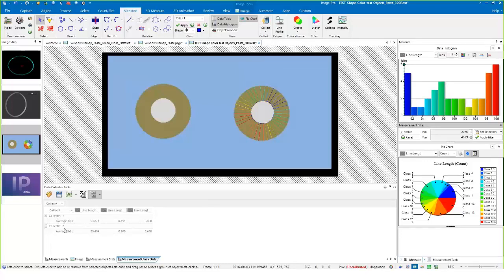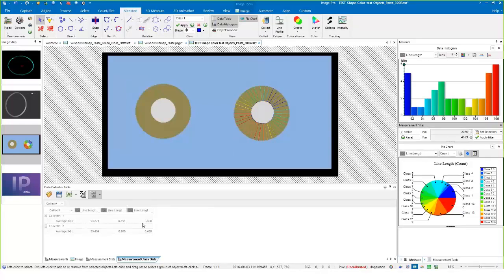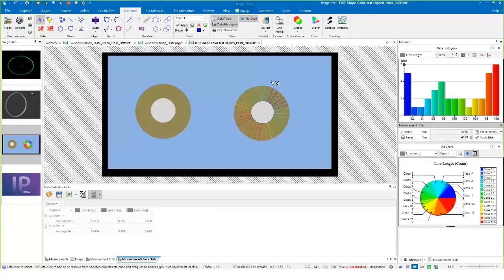Now we can see the two sets of data from our first collection. We have numbers like 94 and the second one is 99, so these segments, the average line length was obviously larger here. Our distribution and our ranges are higher also. So anyway, this was sufficient for what the customer needed and they were really happy. They were able to do quality control on their samples.